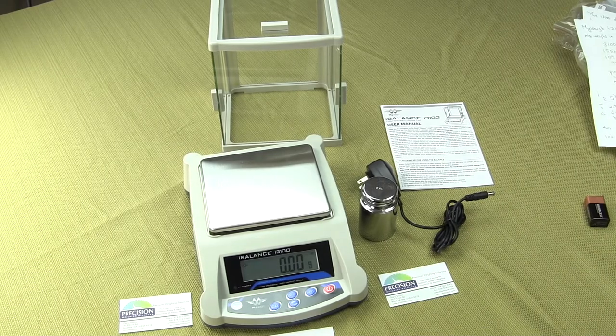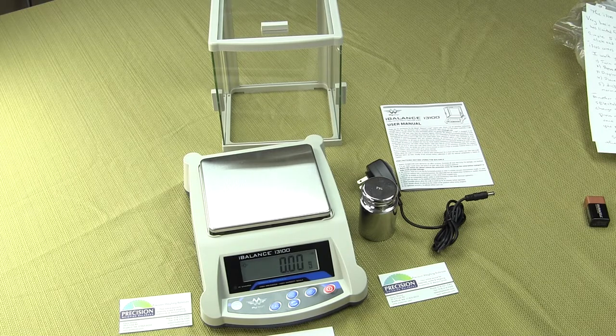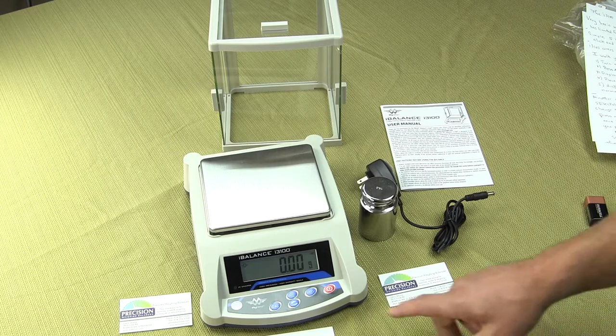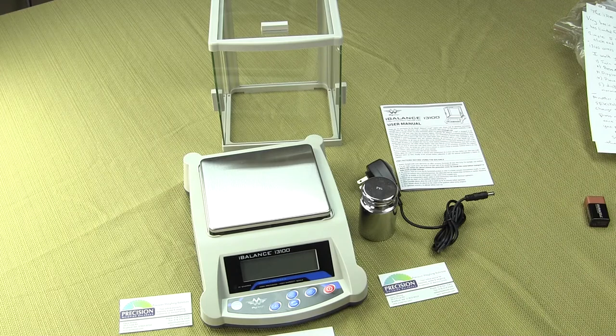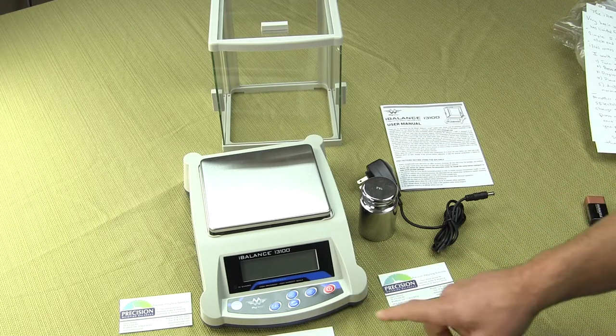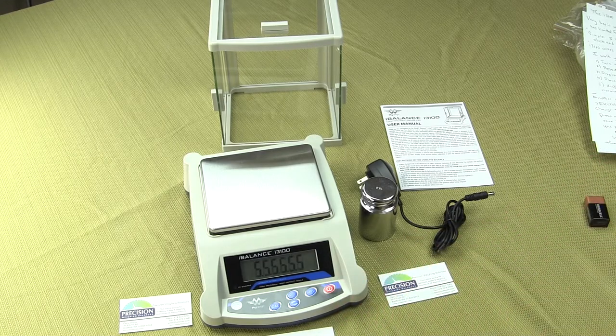The scale operates on either the AC adapter or the internal battery. It's a very basic digital scale — you have five buttons altogether that control the entire scale. You have the on/off button, and these keypads are all tactile keypads so you can feel them when you press them. There's also an annunciator, so you can hear when the balance beeps during the power-up sequence.